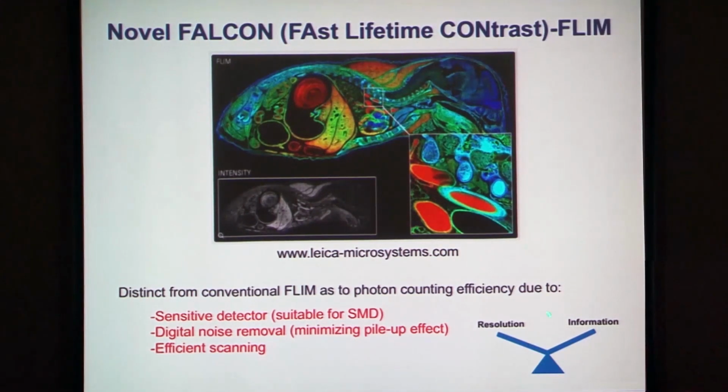So now we don't have to worry about the photon budget, where we must prioritize resolution or information, because using FALCON we can obtain high resolution and high information imaging.